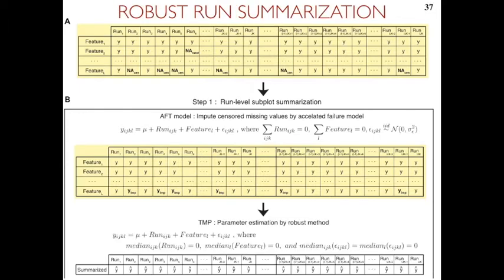And so after this summarization, we have one number per protein per run. And this is pretty much now in the framework of what we did last week, right? So, yes? That's a good question. So the example you had here, it's within a protein. It's not trying to draw conclusions about the protein which you don't see. So let's say it's a protein that has 3 features. Exactly, yeah. So remember, what we do here is just one protein at a time. This table is only a table for one protein. So everything I talk about here, because different proteins will have different abundances in the runs, right? You really want to do it separately. That's kind of the point, right? You want to know how different proteins change between the runs. So behind the scenes in MSstats, there is a loop which takes protein 1, does this, protein 2, does this again, and so on.